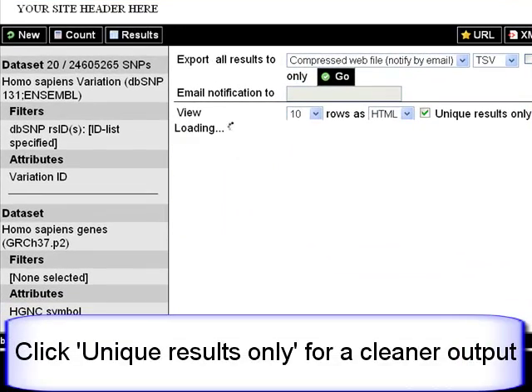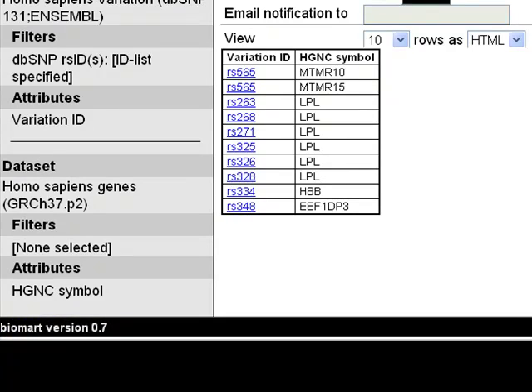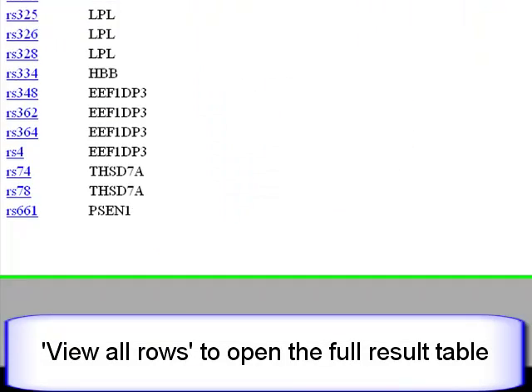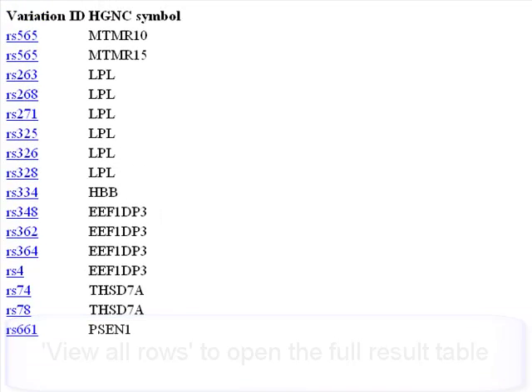Click Unique Results Only to get rid of BioMart's inherent redundancy. When I'm happy with the result preview, I can view all rows. A new tab opens in my browser.